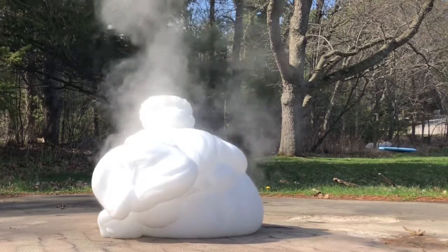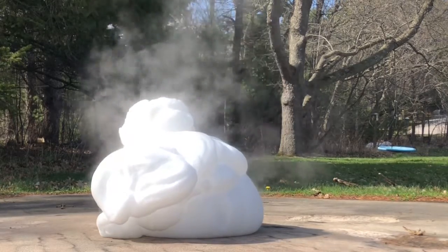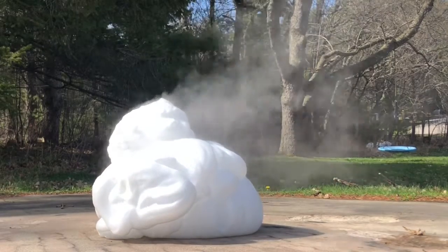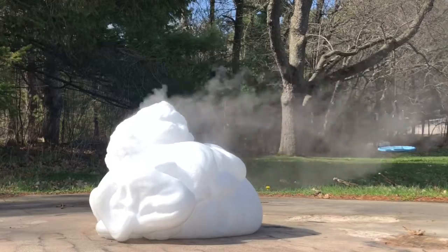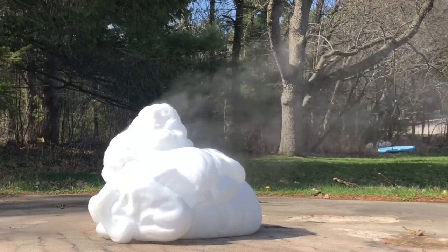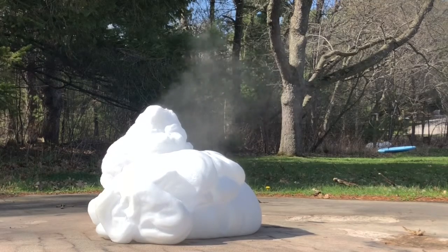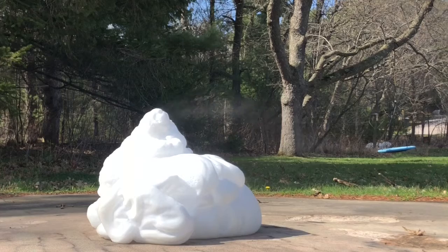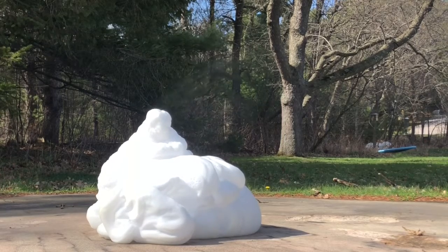You want to notice all that stuff coming off there? That's steam. So one of your questions is if this experiment is exothermic or endothermic. If it's making a bunch of steam, what do you think we got? Also, you're going to tell me, do higher concentrations or lower concentrations happen faster, and why?